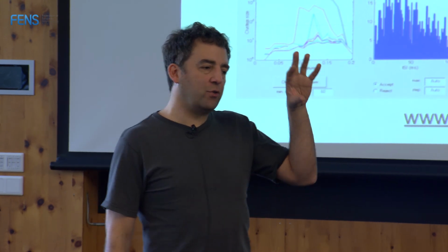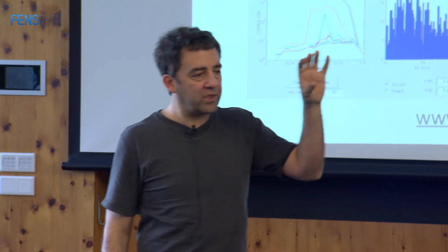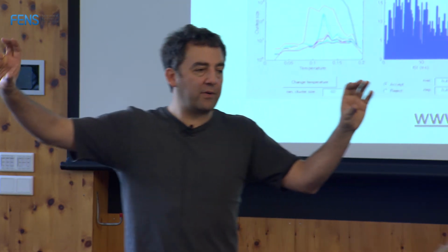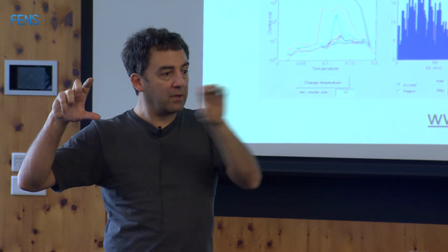So basically, you have to track the neuron on a continuous basis, and if you see a radical change in the spike shape, you know that something went wrong. Now, if you see smooth changes, maybe if you take the first 5 minutes and compare it with 4 hours later, the spike shapes look very different. You say, well, it's a different neuron. But if you track the recording, and you see that the change has been smooth, then it's fine.